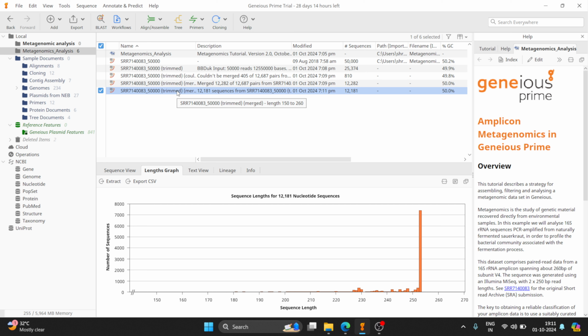So we have to do the de novo assembly now. Amplicon data sets from NGS sequences typically contain millions of reads, and it is not practical to blast each sequence to assign taxonomy. So instead, we will define an operational taxonomic unit by clustering the reads by similarity. So we can then use this blast results as a target taxonomic database with the sequence classifier plugin.